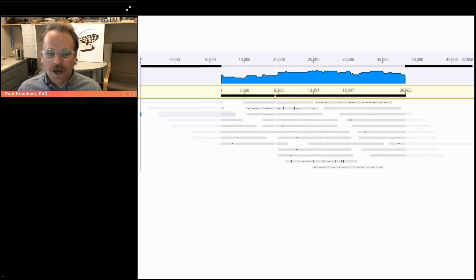And so when I first saw this, I realized, oh, caddisflies are diploid. They get a copy of chromosomes from their mom and a copy of chromosomes from their dad. It's possible that there's a lot of heterozygosity here. So I wrote a quick script when I first got these data back, right after the technology was released, and binned these reads into those that had mismatches versus those that had fewer mismatches. And then I generated 2 new assemblies, and voila. You can notice that the reads match back to the consensus with much higher accuracy.